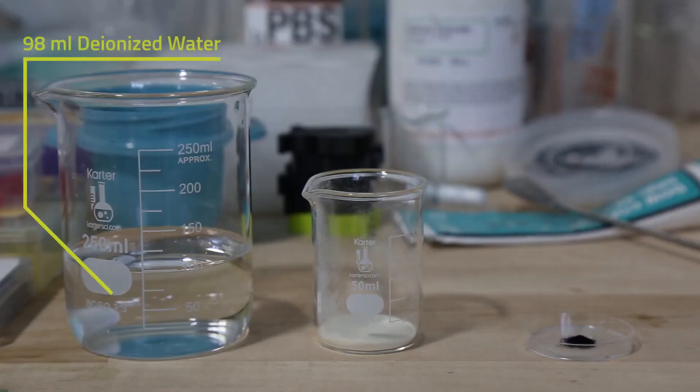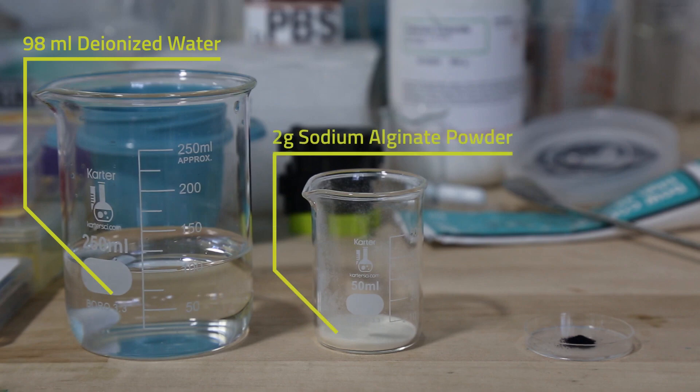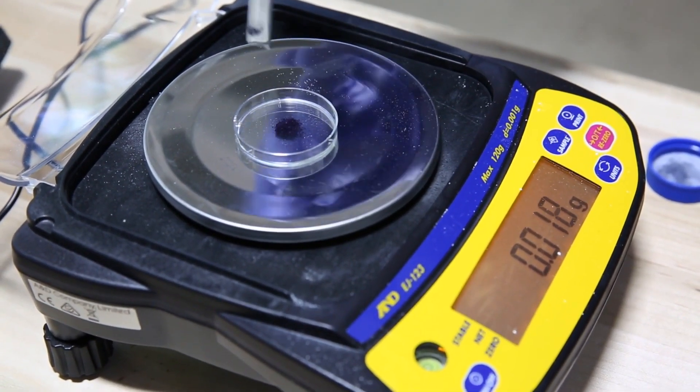We need 98 milliliters of deionized water, 2 grams of sodium alginate powder, and 0.02 grams of Alcyon blue dye. The dye is because the sodium alginate is clear, so we want to be able to see the print when it's printing.